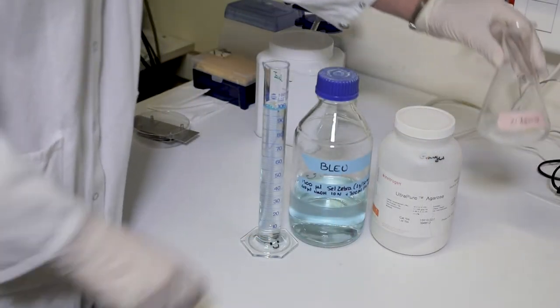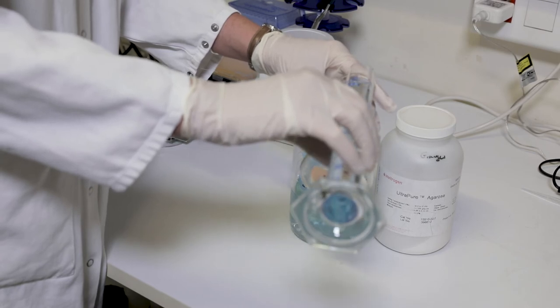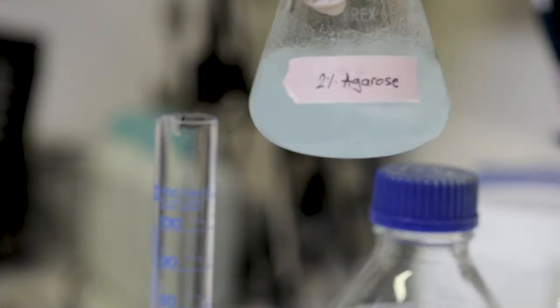To prepare the injection chambers, we make 2% agarose solution in zebrafish water containing methylene blue to avoid contamination.